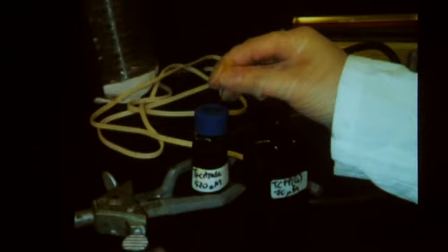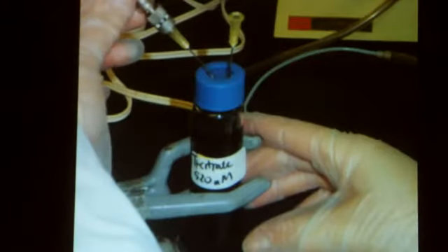So, before inserting the actual tube of nitrogen gas into the lid of the titanium citrate bottle, we insert a tube so the air can escape, and that's that yellow thing here. And we just poke it through the bottle. Then we turn on the nitrogen tank. And then we insert the tube of nitrogen gas just next to the tube where the air escapes. Just through the lid, it pokes right through.